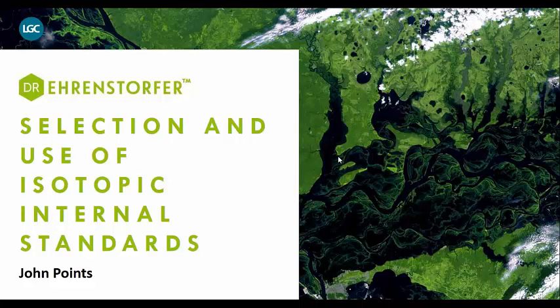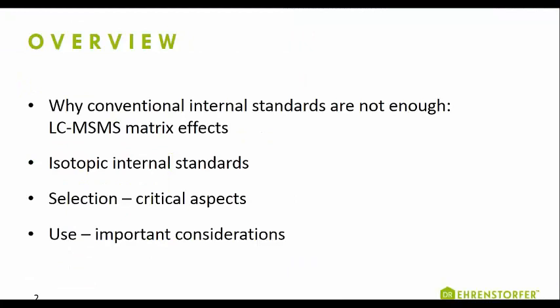And today I'd like to cover some aspects of selecting and using internal standards for trace organic analysis. I'll briefly explain what internal standards are, but show why conventional internal standards cannot be used to correct for LCMS matrix effects. I'll show why isotopic internal standards are the ideal solution, and then focus on some key points in both selecting and using isotopic internal standards.